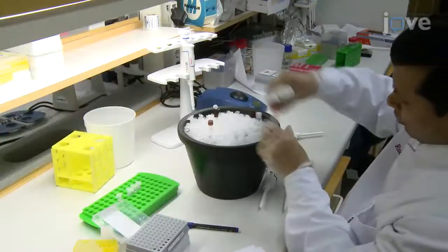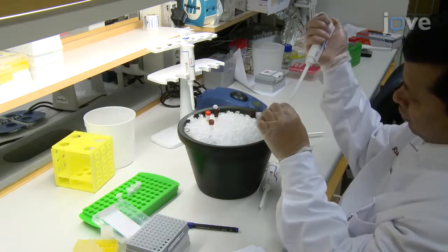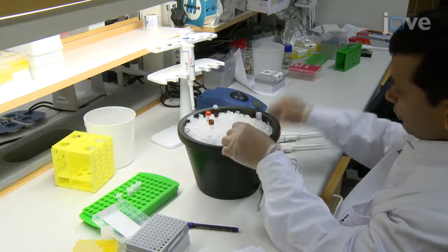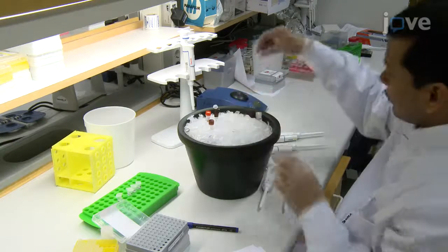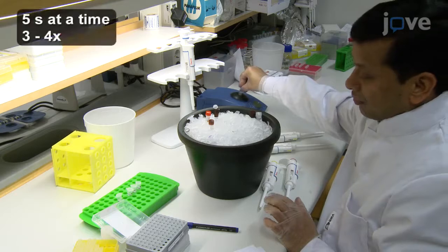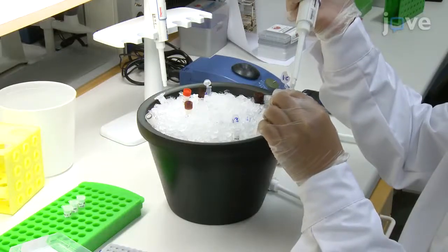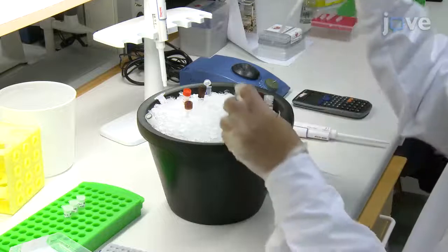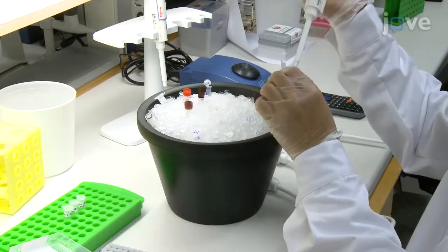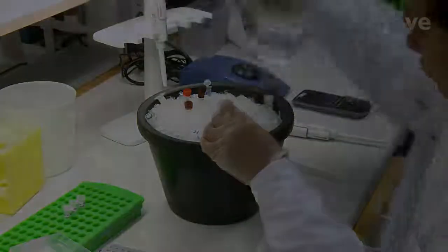Next, add 3.325 µL of standard ladder, 6 µL of protease inhibitor, and 3 µL of DMSO inhibitor to 137.675 µL of ampholyte pre-mix. Vortex the sample for at least 15 seconds and keep on ice. Mix the two prepared solutions in a 1 to 3 ratio so that the final concentrations of DMSO, protease inhibitors, and the isoelectric point standard ladder are 1x and the proteins in the capillary reach the final desired concentrations.